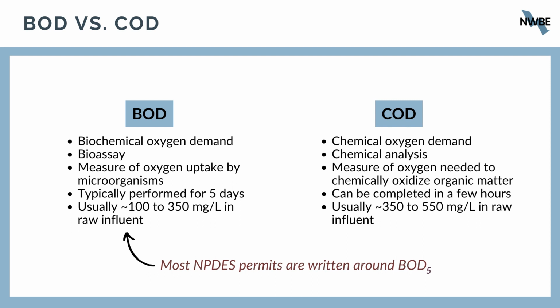Because the standard incubation period is 5 days, it takes 5 days to complete the test, and it is called BOD5. COD, on the other hand, is based on a chemical reaction and the idea that organic matter should be fully oxidizable to carbon dioxide in the presence of a strong oxidizing agent under acidic conditions. So for COD analysis, the strong oxidizing agent is usually potassium dichromate, and the acidic conditions are generated through the addition of sulfuric acid. The amount of organic matter in the sample is back calculated then from the amount of oxidant required for the oxidation reaction.